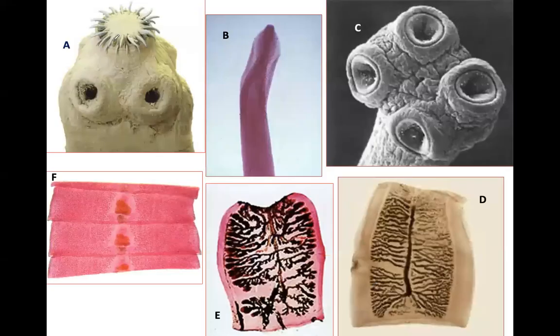of what we've just studied. Okay, so let's go in the chat. Let's discuss A. What do you think A is? So let's start with identify. What is A? All right, people are saying Taenia solium. So that's the first question, identify: Taenia solium.